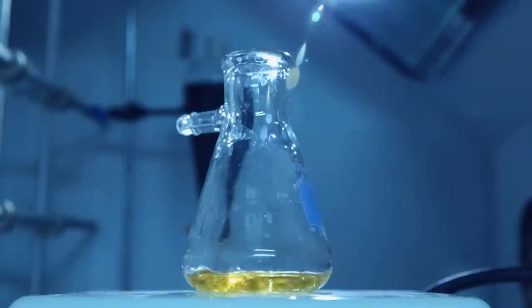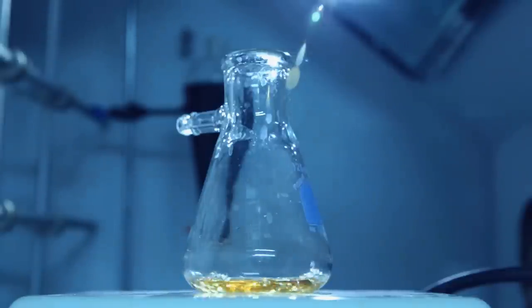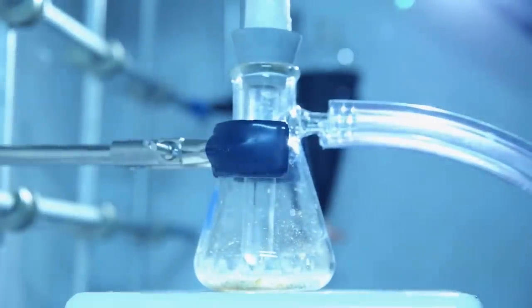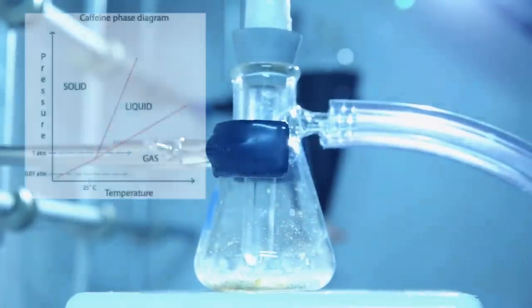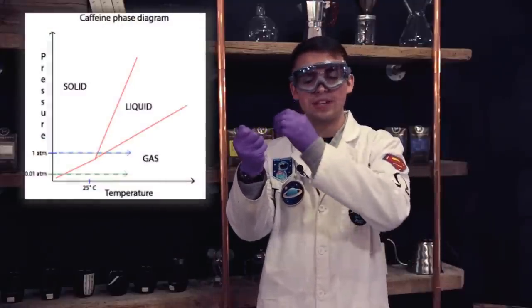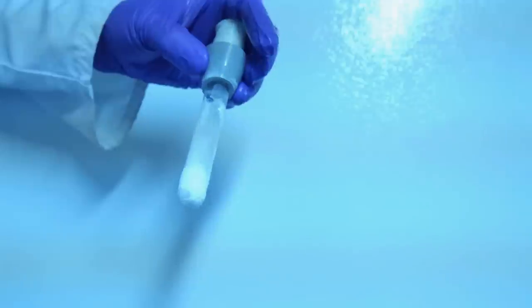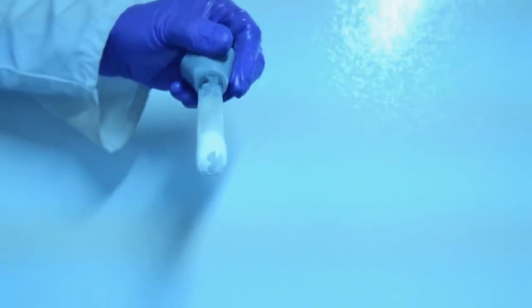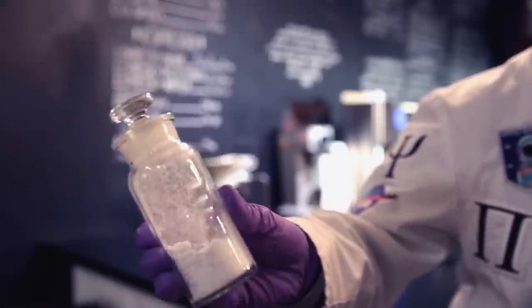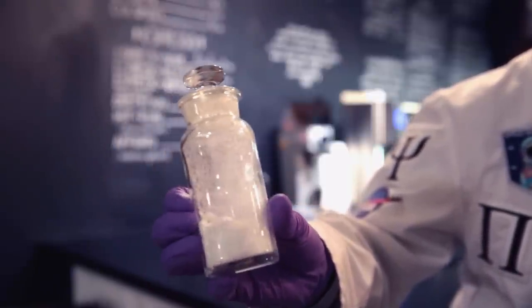To purify our caffeine, we used a technique known as sublimation. So we took our caffeine from the solid state to the gas state and then condensed it back into a solid onto a test tube, and that produced very pure caffeine. And here are the extracted crystals of caffeine from our coffee.